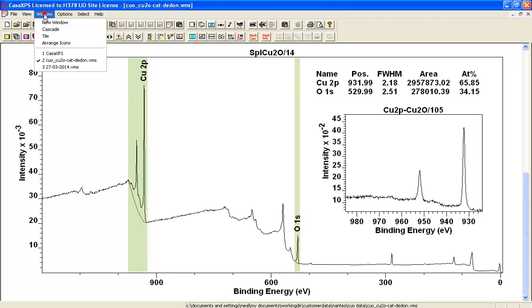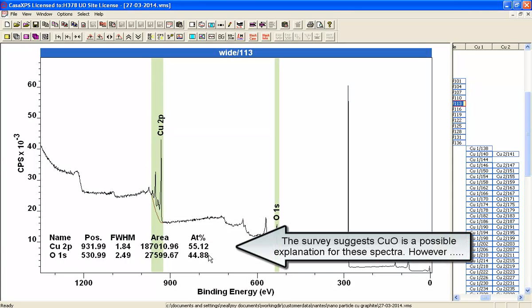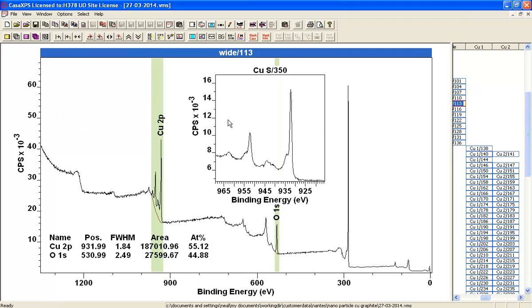So it's reasonable to go back to our data and think to ourselves that we might have a predominantly copper 2+, with a bit of copper 1+. However, if you look at the copper 2p in more detail, it's quite clear that there's a sharp peak here, and the loss structure and the broader peak that would be associated with the 2-plus state is suggesting that the results we're getting from the survey spectrum are somewhat wrong.